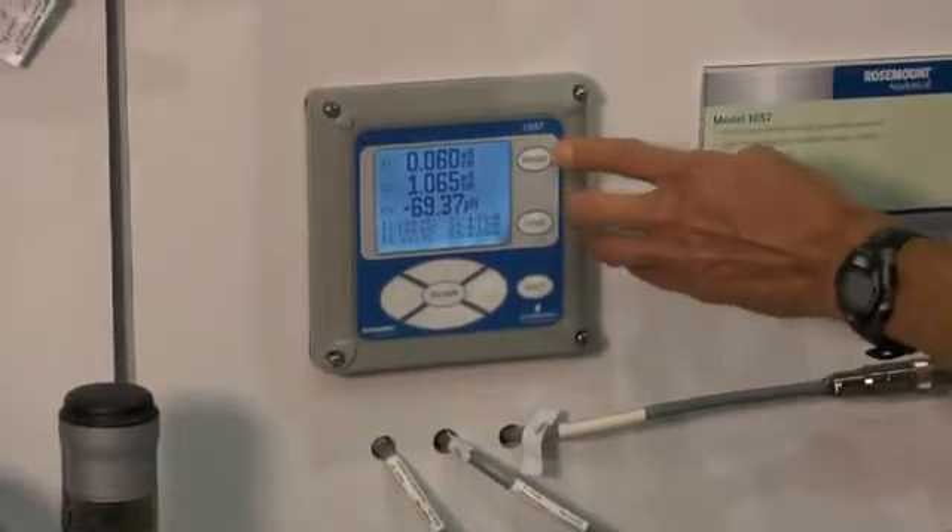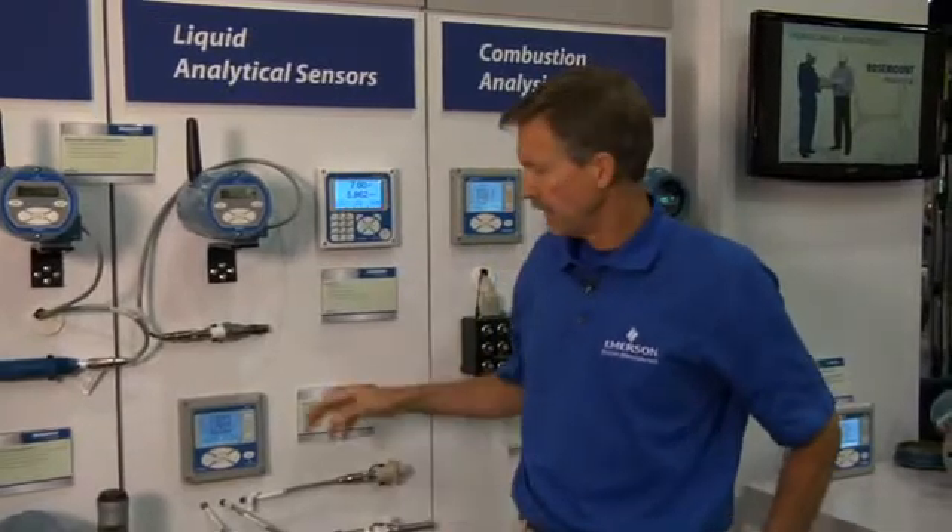That should give you an understanding of some of the key features of the Model 1057 analyzer — that it allows three inputs of measurement — and shows you how the unit actually solves problems for customers like OEMs and pharmaceutical companies that require redundant measurement. If you want more information about the Model 1057, you can refer to our website at railiquid.com.